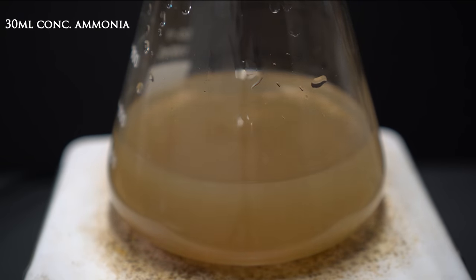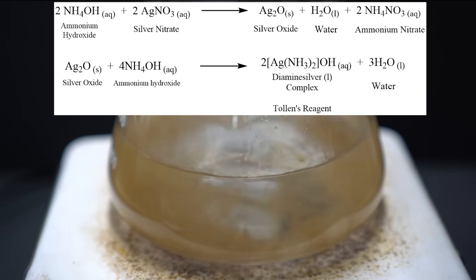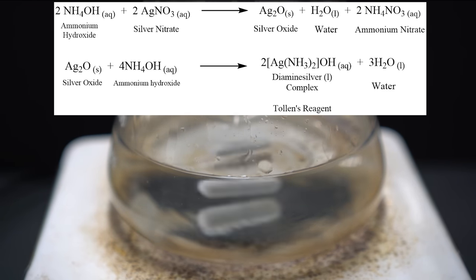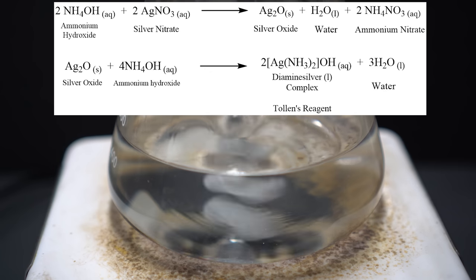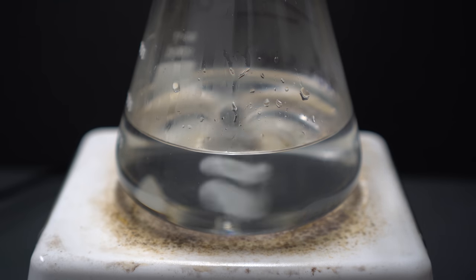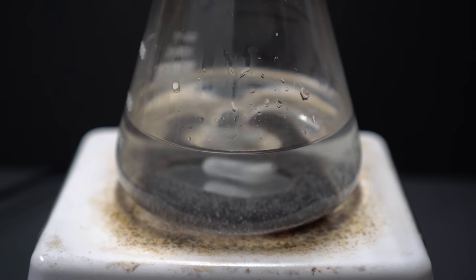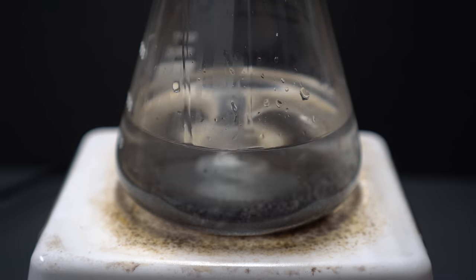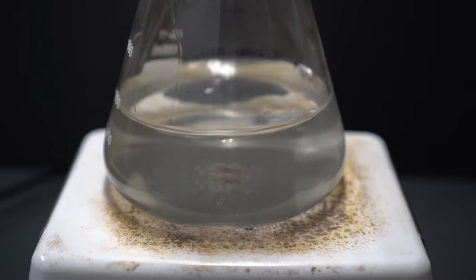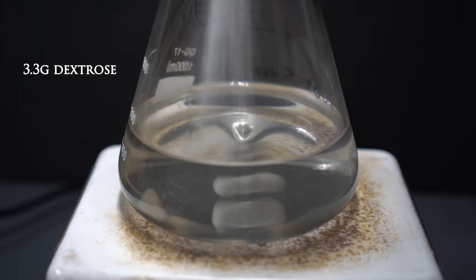30 mL of ammonia was added and you can see it turns that orange color again, however this time after some stirring it clears up and fully turns into a clear solution. The ammonia and silver nitrate react to make silver oxide, water, and ammonium nitrate. The silver oxide then reacts with ammonium hydroxide again to make a diamine silver complex, which is the Tollens' reagent — this also makes it more water soluble. 8 grams of sodium hydroxide was added to maintain the basicity of the solution. This makes silver oxide again, but with excess ammonia in solution it completely dissolves. Finally, dextrose was added because it has our aldehyde functional group.